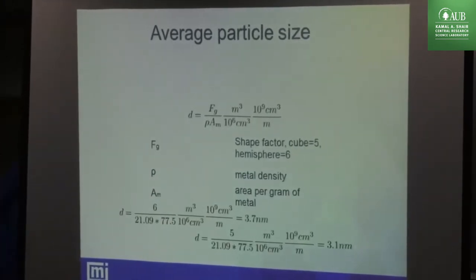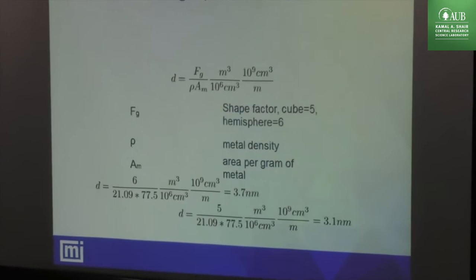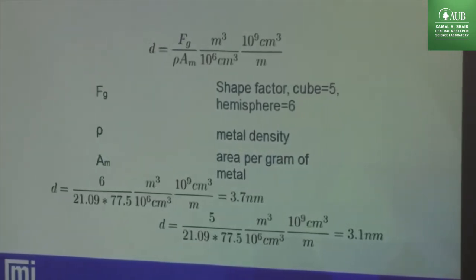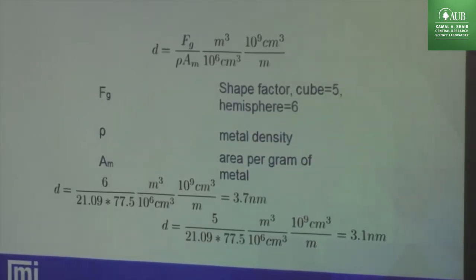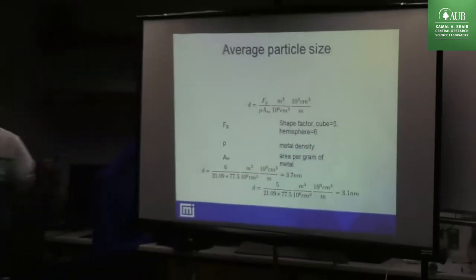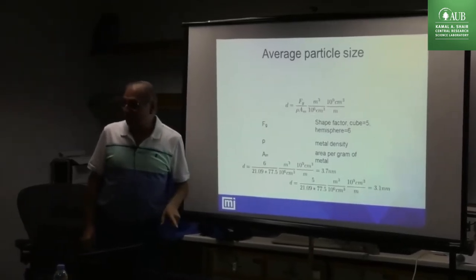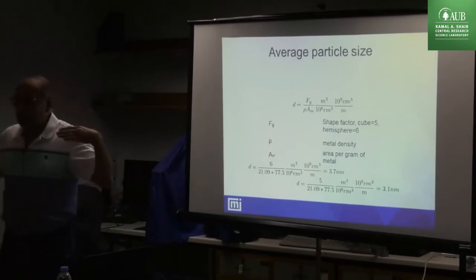In the oil refineries, where they have tons of catalyst, every day they take a small sample from the top, the middle, and the bottom of the reactor. And we measure only the D value, okay? If the D value is increasing, they have to shut down the reactor. Why? Because if D is getting larger, you are sintering your sample, you are losing activity, okay? If you lose the activity, you have tons of catalysts, so big, big reactors, and this is millions of dollars.